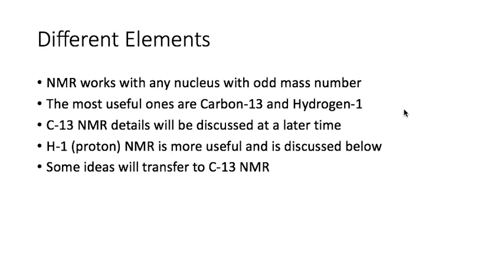Now hydrogen-1 is the normal isotope of hydrogen. That's just a proton nucleus and no neutrons. If you have deuterium, which is hydrogen with a neutron, then that does not have a net spin, and that will not be helpful for this type of spectra. The only thing it is good at is that certain hydrogens are easy to swap out and swap back in, so it is possible to identify a specific signal going with that if you add some deuterium to the system.